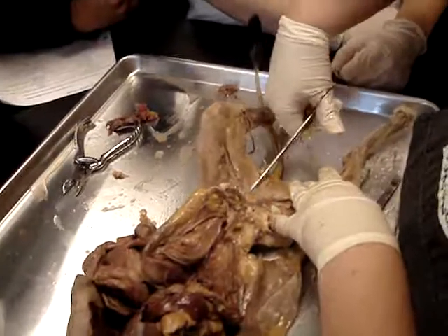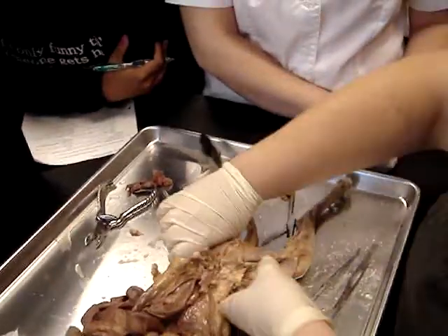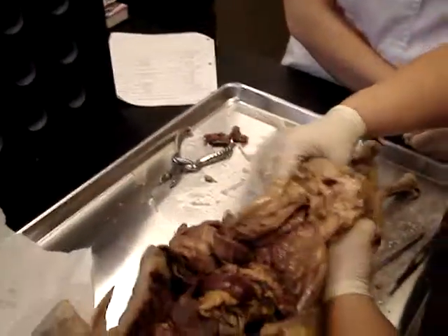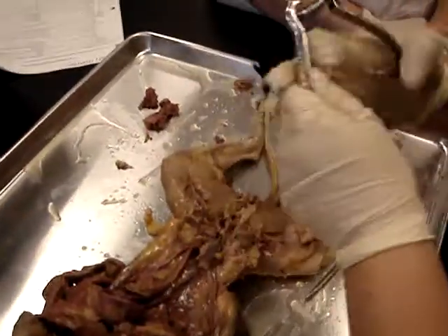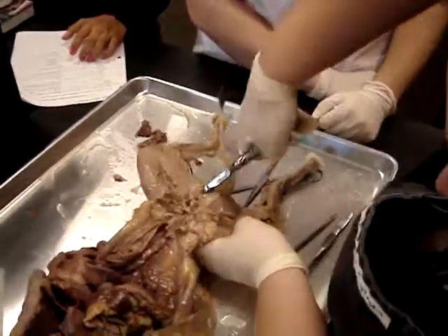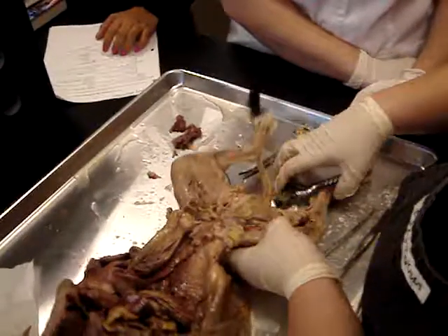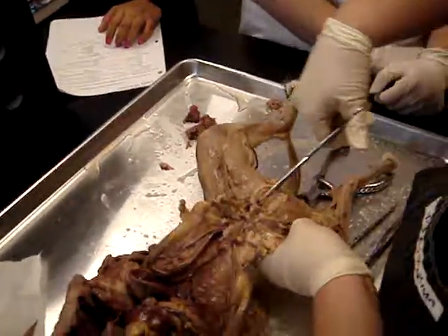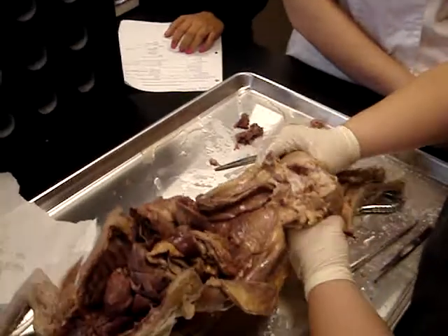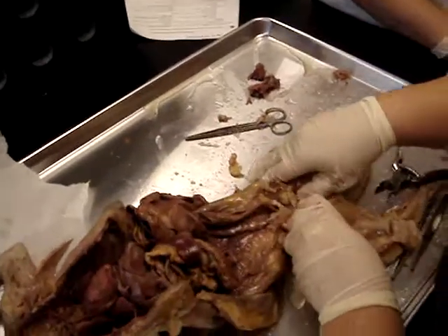So we're going to crack her pelvis open. Hardcore cesarean. Cesarean would be up here. This is cutting through the front of her pelvis. Oh, and she's got a great pubic symphysis that just broke right in half. That's fabulous. So we got bone snips. That's what these are, that we can use if I can get a hold of her pelvis, to cut through her pubic symphysis. I think I'm going to use scissors just because I can't grab that. Just like snapped her. And she snapped well, too. Okay, so I just cracked her open.